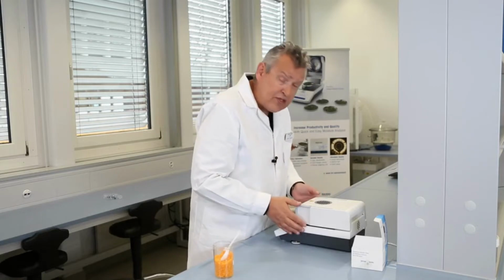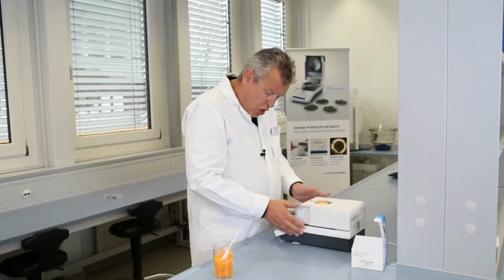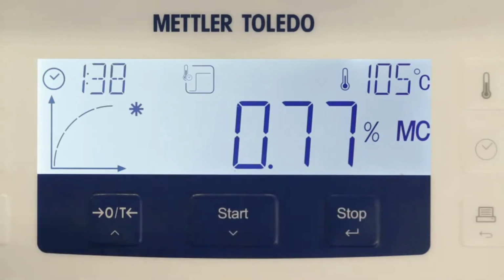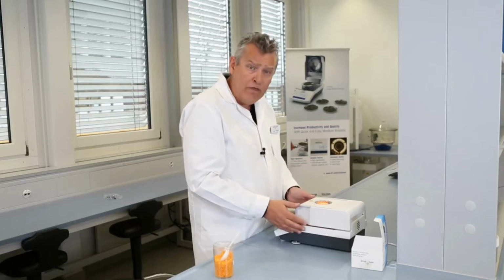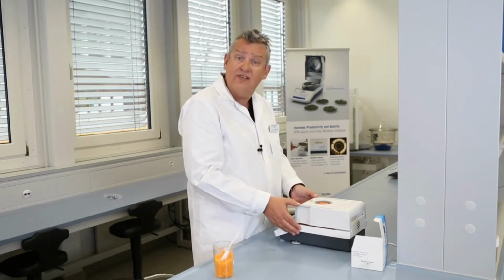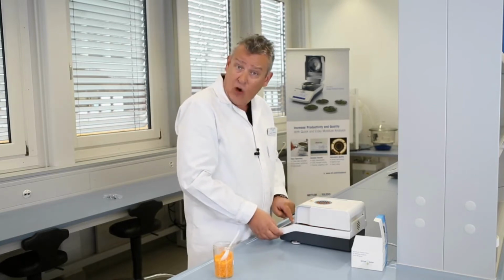The instrument starts to heat immediately, as you can see from the halogen lamp. Notice the graphic indication on the display. You can see the current moisture content, the elapsed time, the current drying temperature, and the graphical progress indicator, which is providing an overview of the measurement's progress. The audible beep at the end of the measurement indicates that the measurement is completed, and the end result is now displayed on the screen.